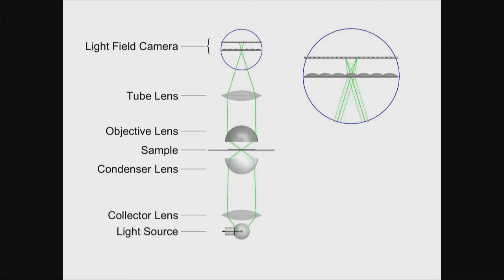That's the reciprocity of angular and spatial resolution in optics. So these marginal rays have a much higher inclination angle in object space than they have here in the image space.